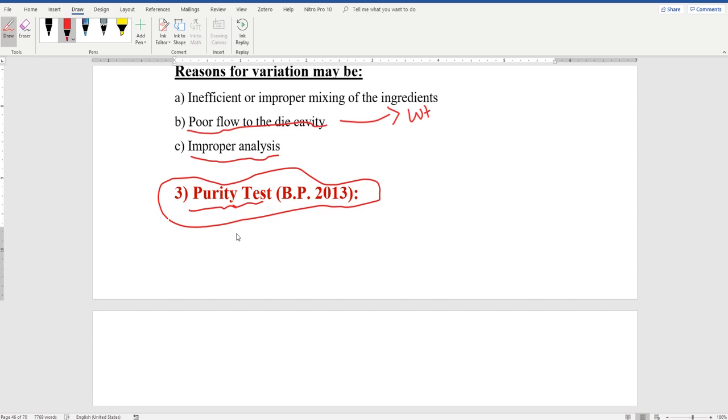Can you use it directly? No, you cannot. You need to check it again, because during transportation something can happen. Maybe the original company did not do the test correctly, etc. So you want to see this raw material of, let's say, paracetamol or even other excipients. You want to see that they are pure enough, according to Pharmacopoeia standard. So you take the raw material and you start testing this pure raw material to see whether there is a significant amount of impurities or not.